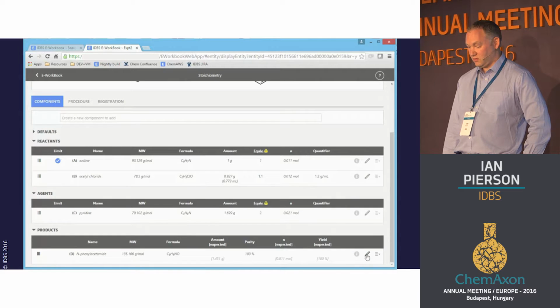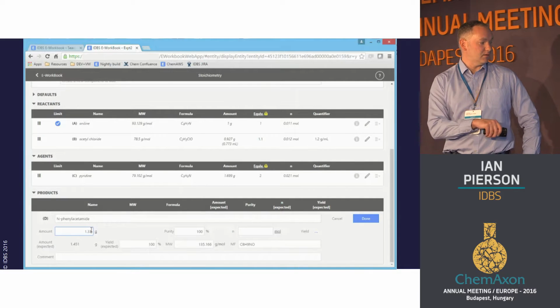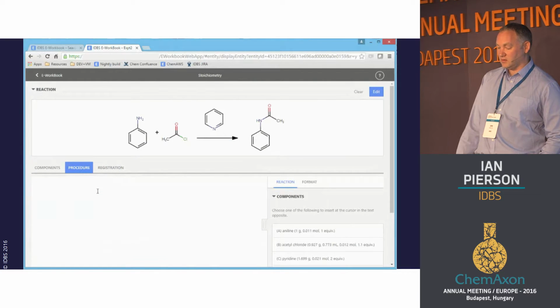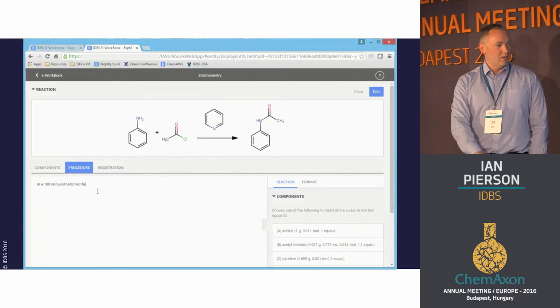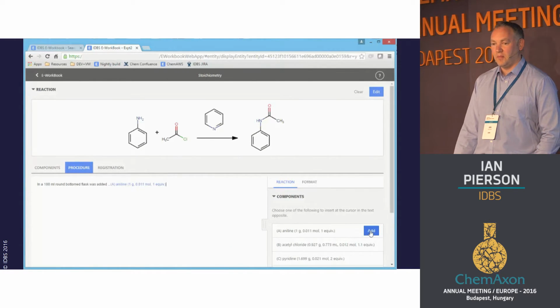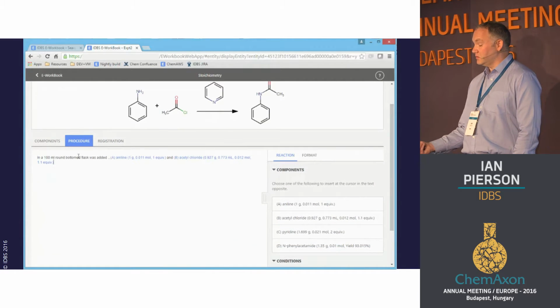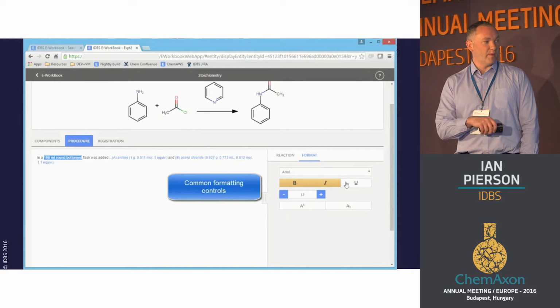And lastly, I'll just go through and add in the expected, the actual versus theoretical masses, and my yields are automatically calculated. And I can come into the procedure window here, and this is where I can start to type some text. And you can see here on the right-hand side, we have this components window, which has automatically concatenated fields from the stoichiometry table and brought them in. So we can just click on the add button, add in those, and that facilitates the data write-up. And if you went back to the stoichiometry table, made any changes in terms of your masses, then the procedure obviously will automatically update as well. And then there's some simple formatting controls we'll put in there.